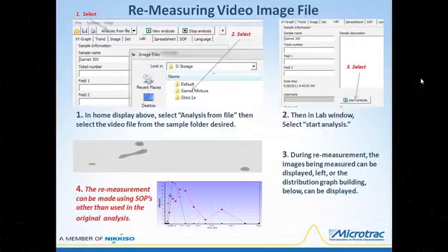Starting in the upper left and then clockwise: select analysis from file in the browser window, then select the video file from the desired sample folder. In the lab window, select start analysis. During re-measurement, images can be displayed moving through the sensing zone or the distribution graph can be shown building. The re-measurement can be made using SOPs other than that used in the original analysis.